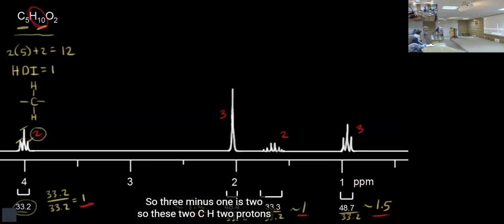Before he goes, I need to know where the 2 and 3 come from. From the integration. When you get the spectrum and you are processing it, as I mentioned, you have to consider something as 1 proton or 2 protons based on your literature, experience, or reported data.